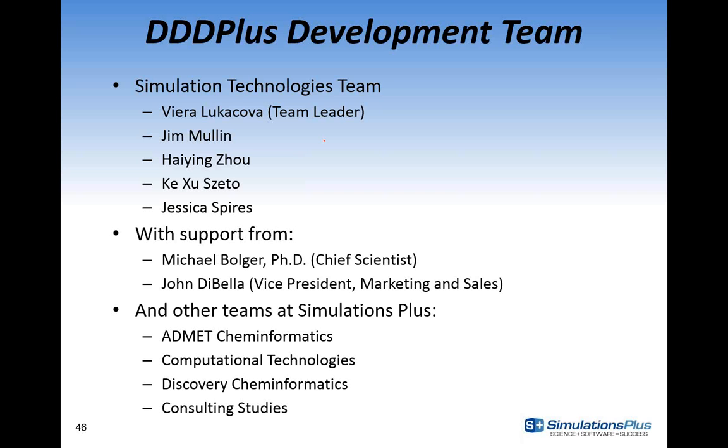Perfect. Thank you, Jim. Another question, and this is related to different formulations. Does DDDPlus have the capability to model lipid-based formulations? Currently, no. We don't have any lipid release models or digestion models within DDDPlus.